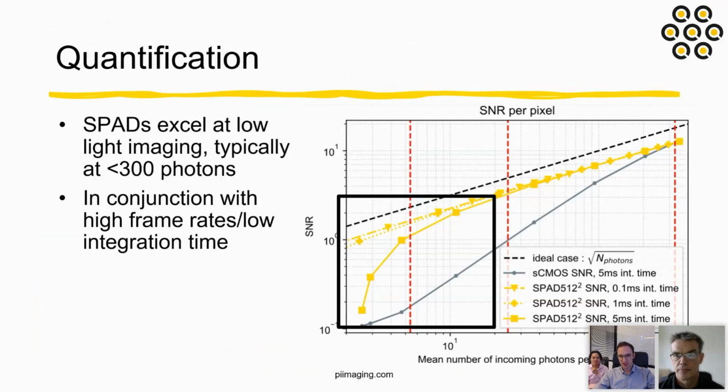The pixel pitch is 16 micrometers. And then we have 2 options. Either we can have microlenses, in which case the sensitive area is 16 micrometers, or without the microlenses it is 6.5. And what about the other 2 detectors that you offer? The other 2 are 23.5 and 29 micrometers.